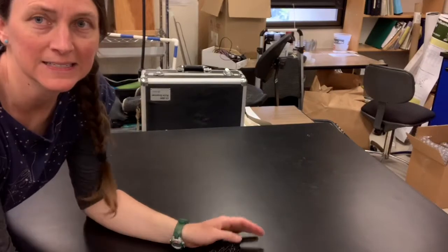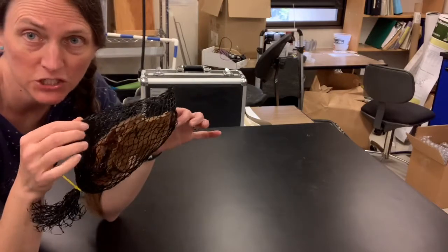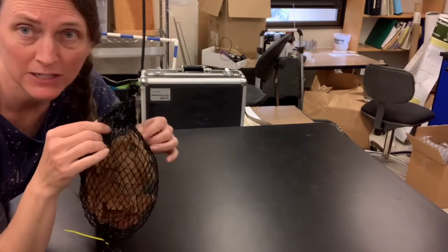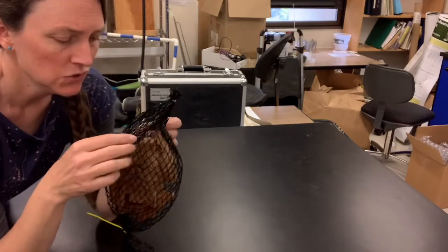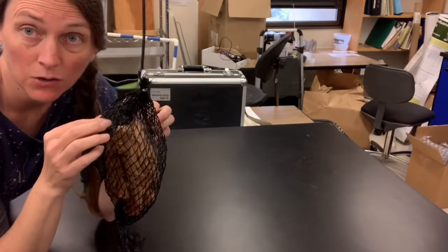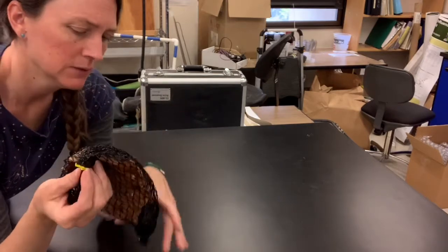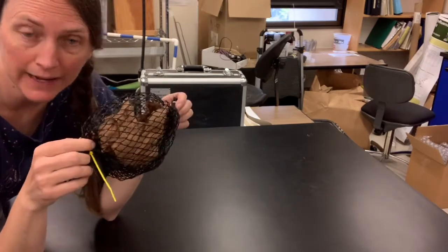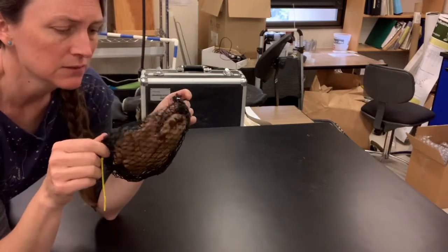The last thing I'm going to talk about is a leaf litter bag. There are a whole variety of mesh sizes and types of mesh bags that you can use to contain leaf litter. Usually you weigh out a specific known quantity of leaf litter and place it in a bag, often including a metal ID tag so that you know exactly how much this leaf litter weighed when you put it in the stream.